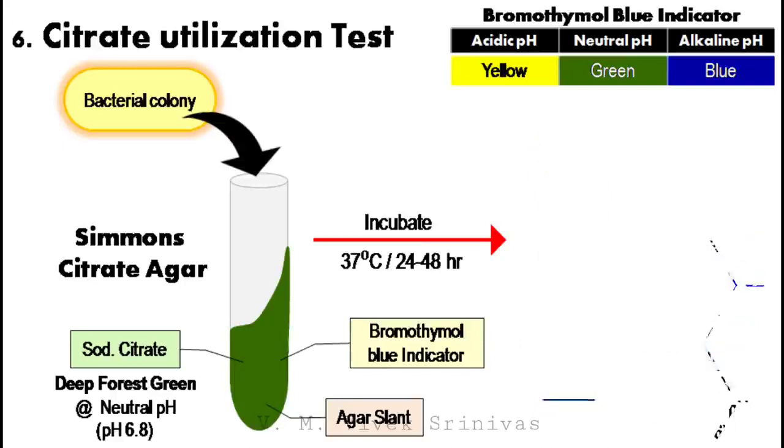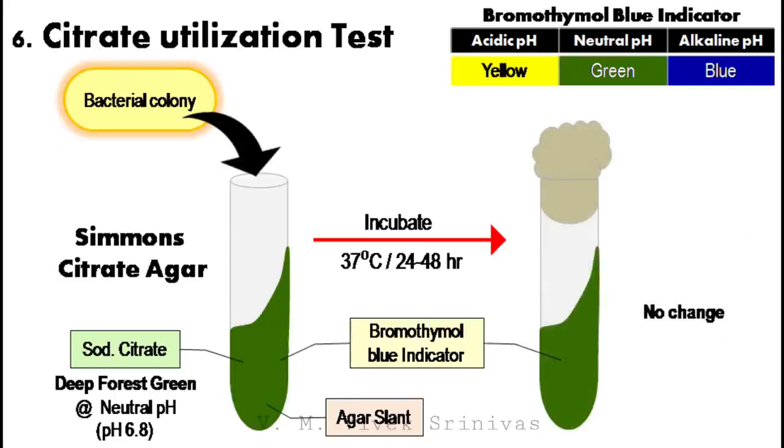In contrast, following incubation, if there is no color change, this indicates the test is negative for the citrate utilization test. The example, the E.